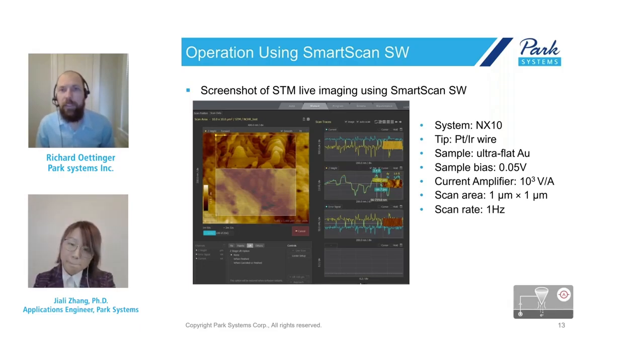Okay. Next one. Could you suggest some ideas for cell imaging in liquid when the adhesion is too high? I cannot get a flat baseline for the maximum setting possible.